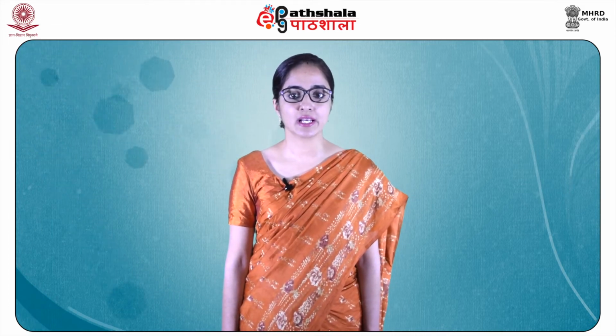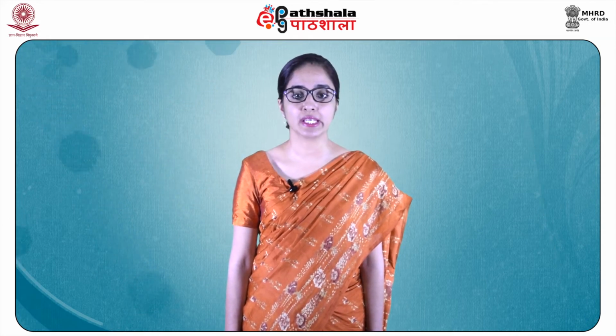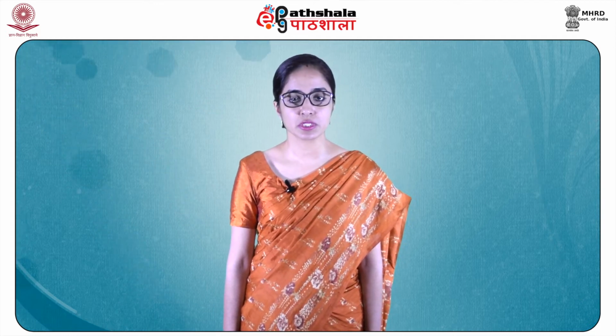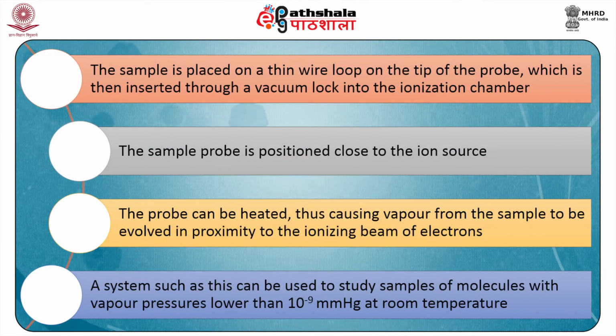For less volatile materials, the system can be designed to fit within an oven, which can heat the sample to increase its vapor pressure. With non-volatile samples, other sample inlet systems must be used, and a common method is the direct probe method. The sample is placed on a thin wire loop on the tip of the probe, which is then inserted through a vacuum lock into the ionization chamber.